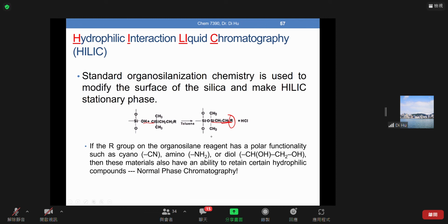The normal phase chromatography has a more polar stationary phase, so it should be able to retain more polar species. Why bother? Good question. Think about the mobile phase of the normal phase. Do you still remember that triangle of selectivity? We mentioned several, right? What are they? Hexane plus methylene chloride, hexane plus ether, and so on, right?